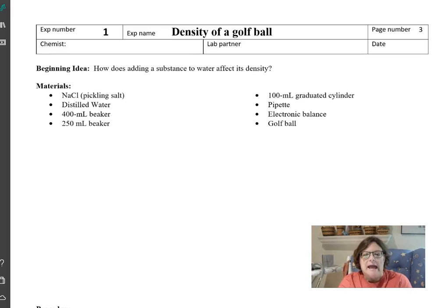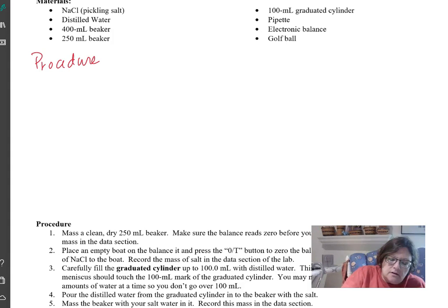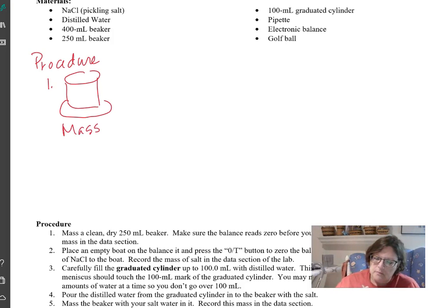So, welcome back. Now we're going to be looking at how adding a substance to water will affect its density. We're going to add salt, sodium chloride. All right, our first step: mass a clean, dry beaker, and record it. Make sure you zero the balance first.